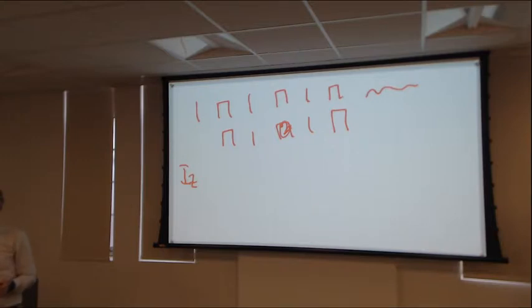So I break a complicated pulse sequence up into the parts in which some part is a pulse and some other part is a delay. And because I assume I'm in the weak coupling limit, I can apply the chemical shift evolution first and then the scalar coupling, or the scalar coupling and then the chemical shift. That doesn't matter. If I'm doing this in my pencil and paper, I assume that the pulses are short. So I'll ignore relaxation effects during the pulses. I'll ignore scalar coupling evolution during the pulses.